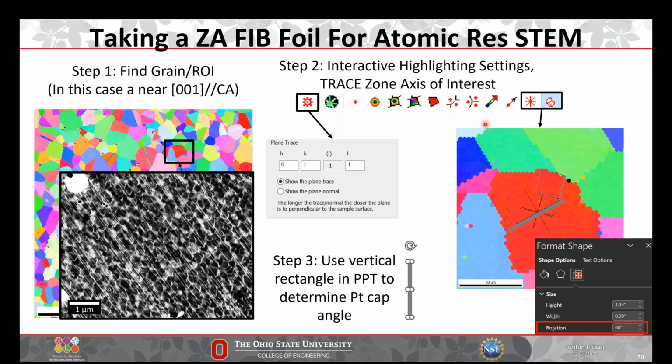I've even seen some cases where you put the foil in and it's bang on zone axis and you don't have to tilt at all. And that's a really happy day. It's a good work day when you do that.